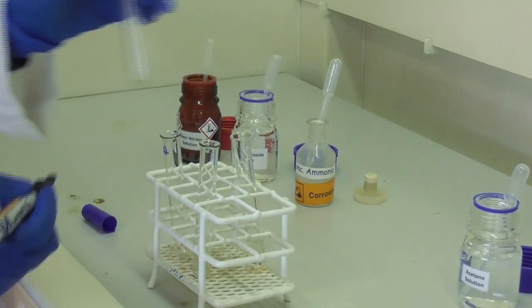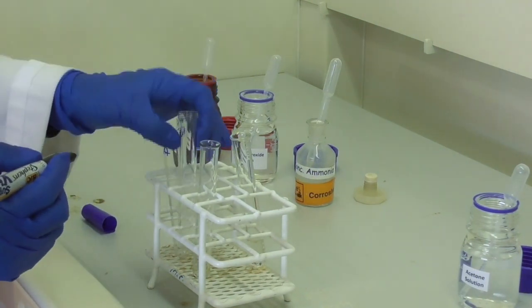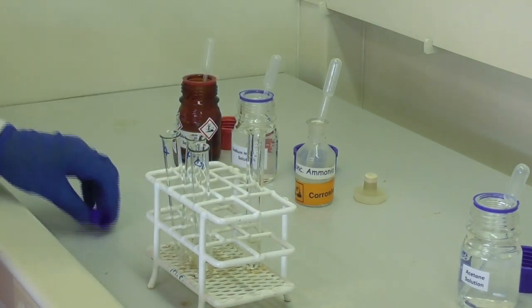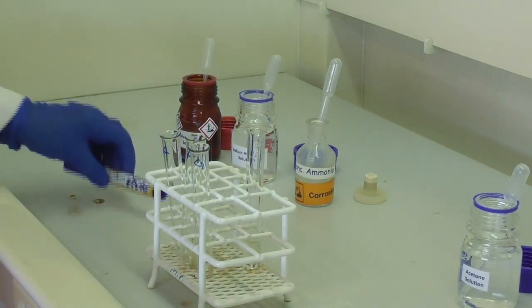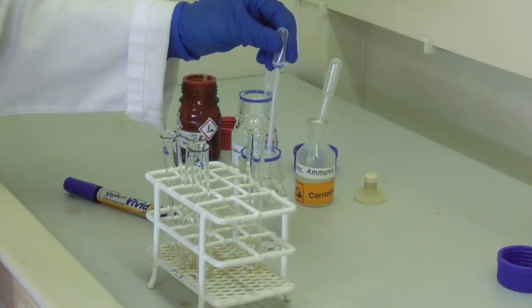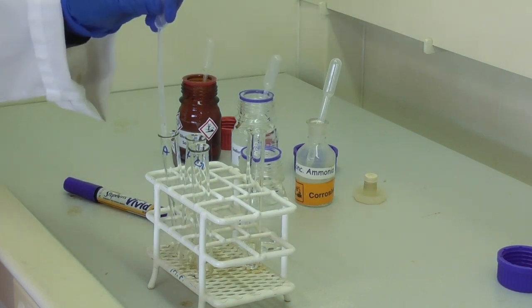To avoid any confusion in the next step, we label our test tubes before adding the reagents. To the first test tube, we add one milliliter of acetone.